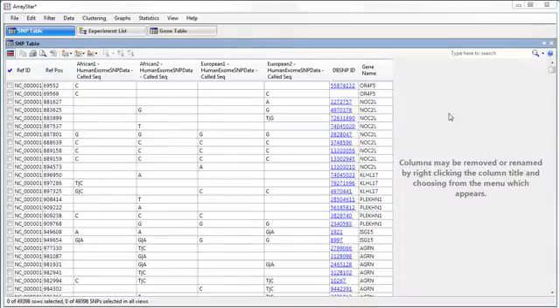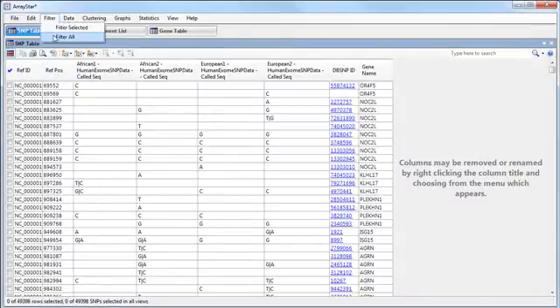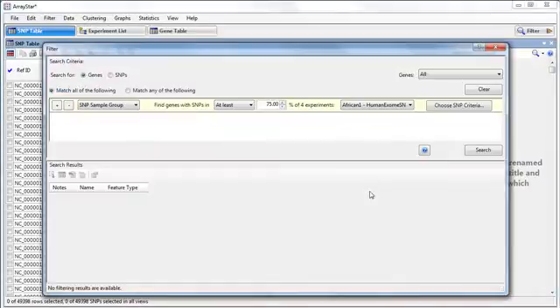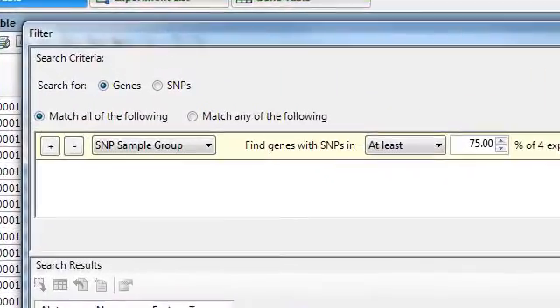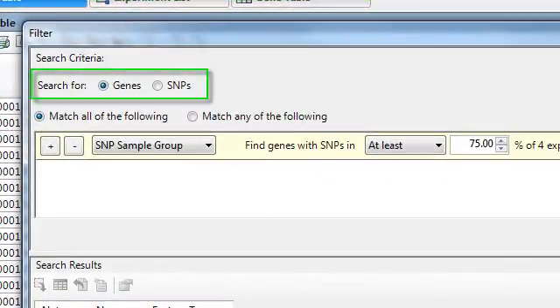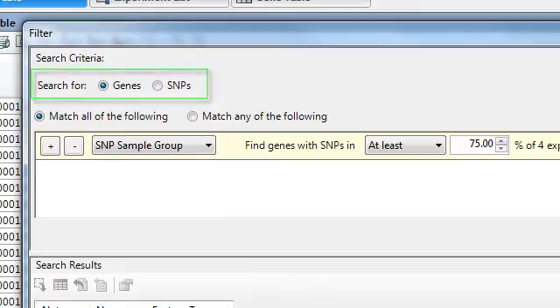Now from here, you may choose to filter your data further. I'm going to open the filtering dialog, and you can see that up here at the top of the window, there's a choice asking you to choose between doing a SNP level or a gene level analysis.